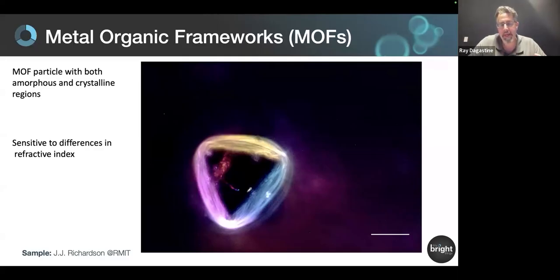And that's because we're very sensitive to scattering off two things: geometry and boundaries, but also simply changes in refractive index. And what we find is you don't need such a big change in refractive index, or the change in refractive index can actually give you really resolvable scattering, even if it's a small, thin film, or it doesn't have to be as thick as you'd expect. And I'll show you a fun example in biology.